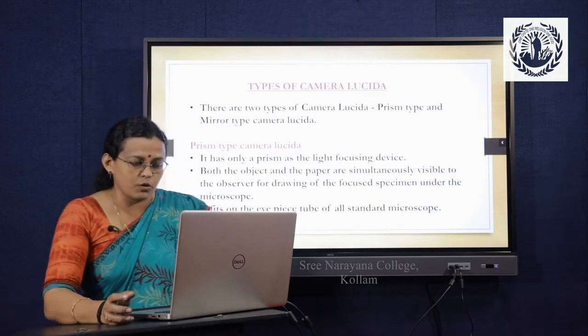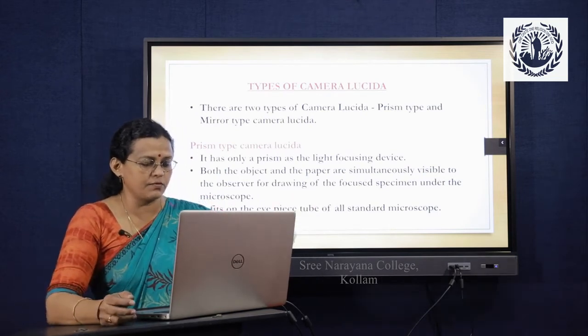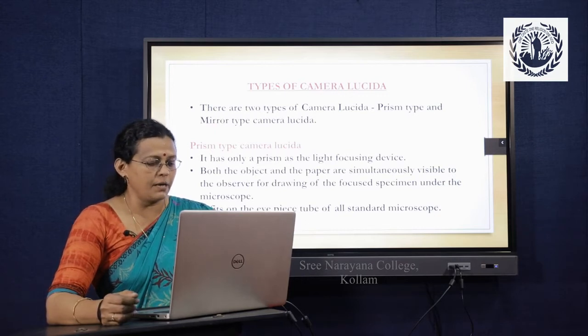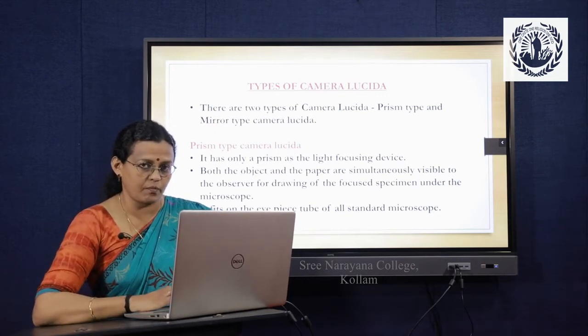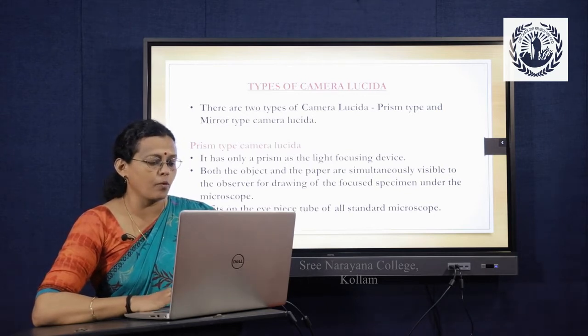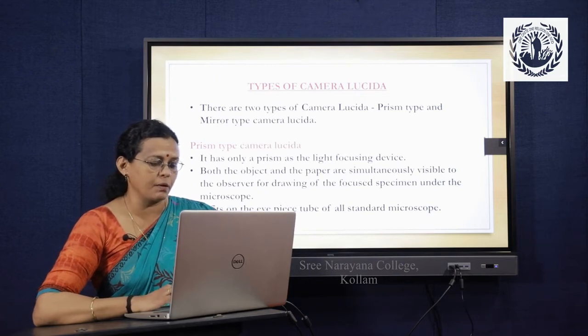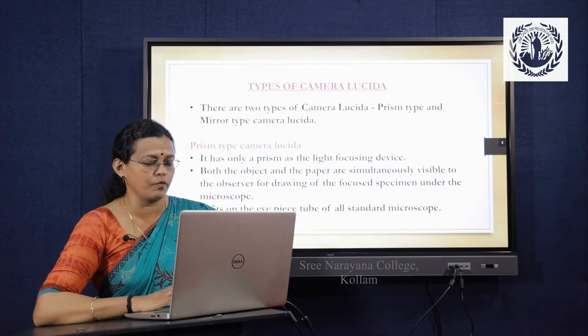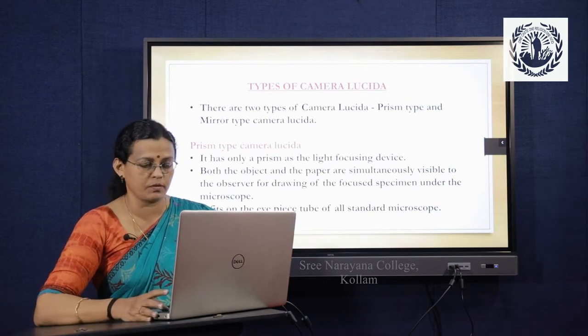There are two types of camera lucida. We will see the different types. One is a prism type and the other is a mirror type. In prism type, there is only the prism along with the attachment ring, and no mirror. Both the object and the paper are simultaneously visible to the observer for drawing of the focused specimen under the microscope. It fits on the eyepiece tube of all standard microscopes.